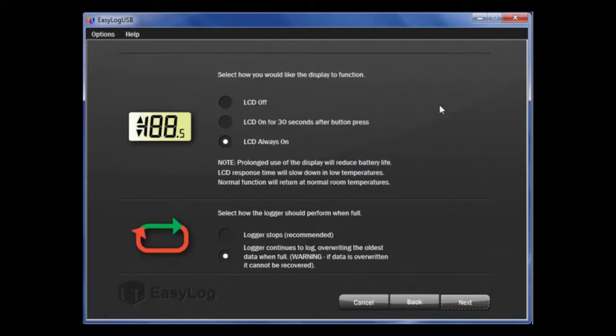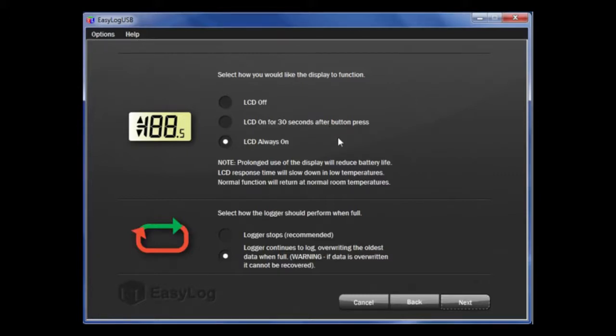Firstly, how often do you want to look at the display? You can choose to have the LCD off, on for 30 seconds after you press the button, or on at all times. Choosing to be economic with the use of the display will improve the battery life of the logger.